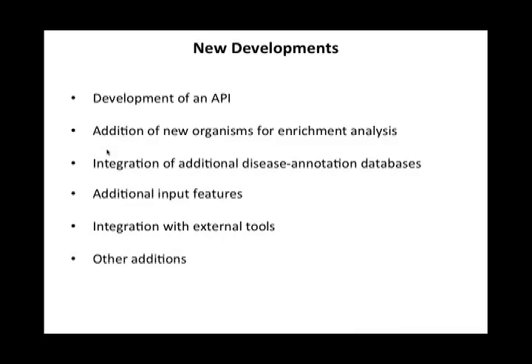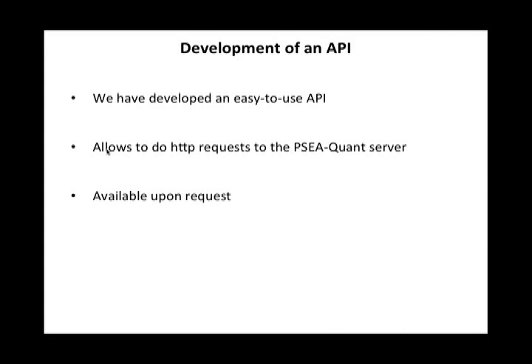So that's actually pretty useful, where the user simply has to input the entire data set and does not need to choose thresholds for the analysis. And it models the likelihood of a protein to be annotated by a certain protein set and protein abundance correlations. I didn't go into the details, but this is all in the Monte Carlo sampling procedure that is described in the YouTube presentation and the paper.